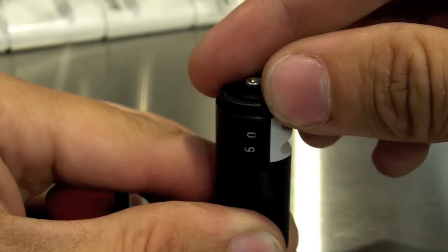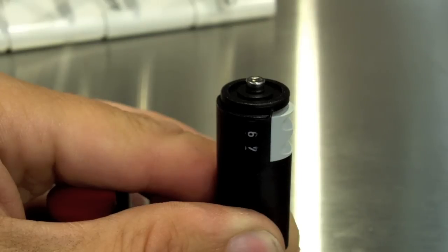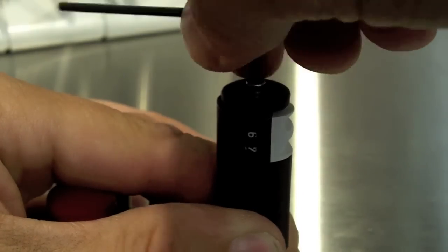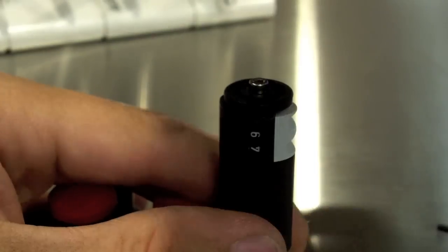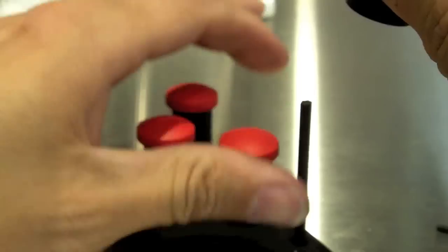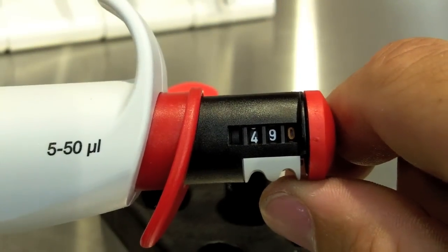Then you simply adjust the volume to display 49 microliters and tighten everything back up. Put the cover back on and now your pipette is calibrated.